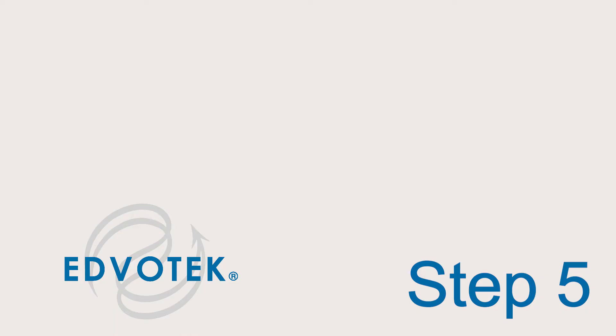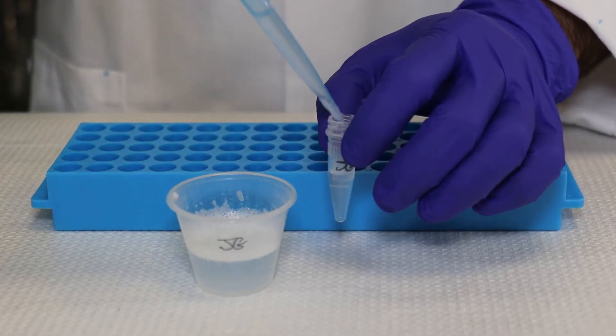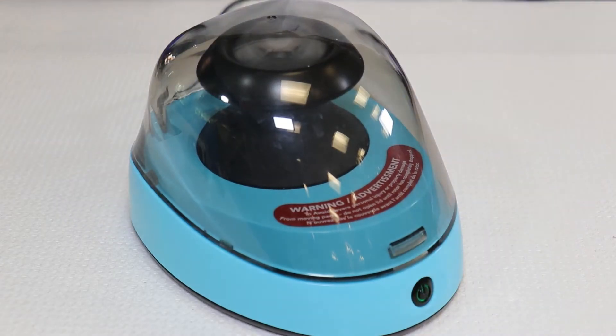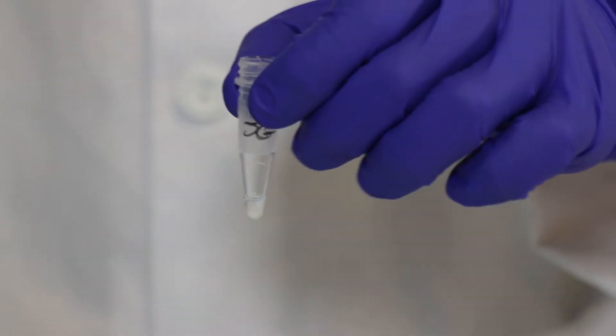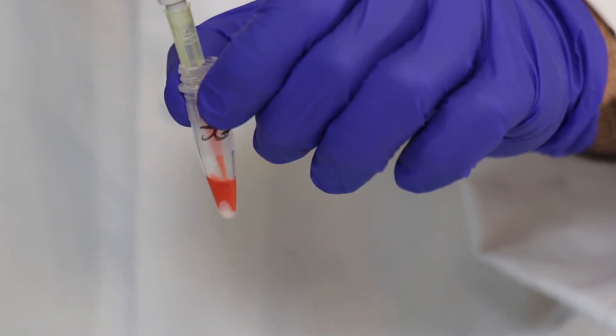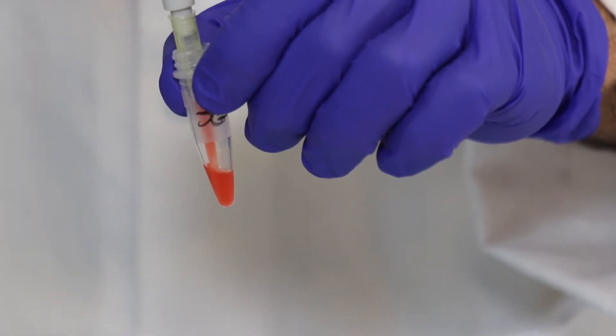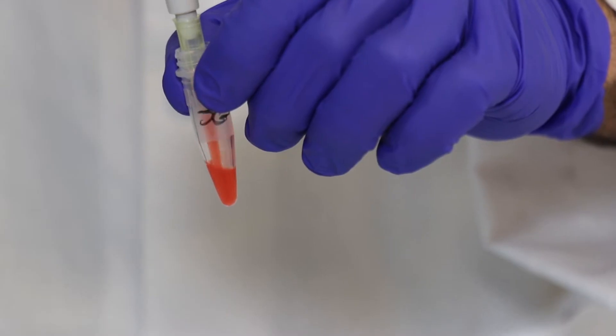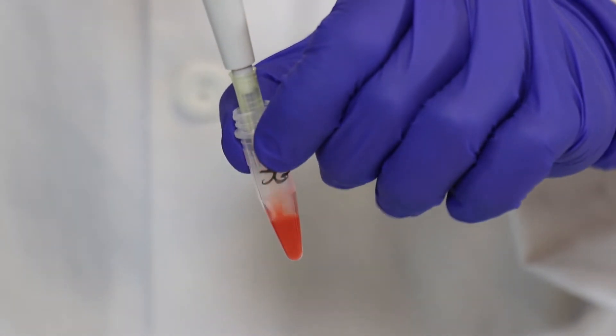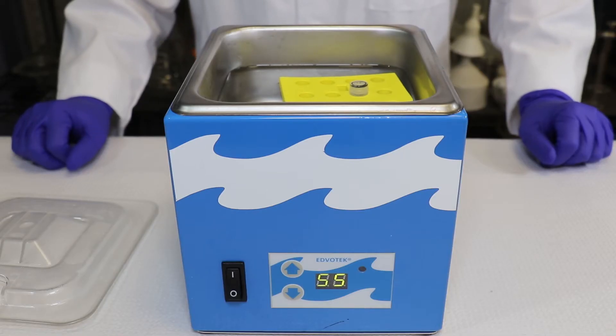Step 5: Repeat steps 3 and 4 once more. Step 6: Resuspend the cheek cell pellet in 150 microliters of lysis buffer by pipetting up and down or by vortexing.